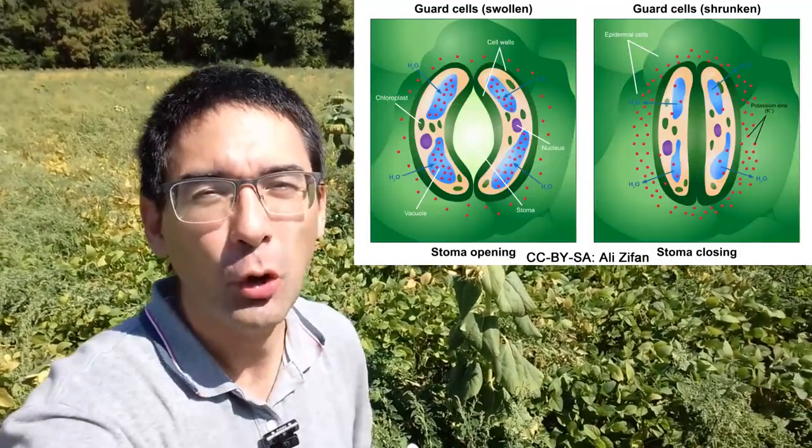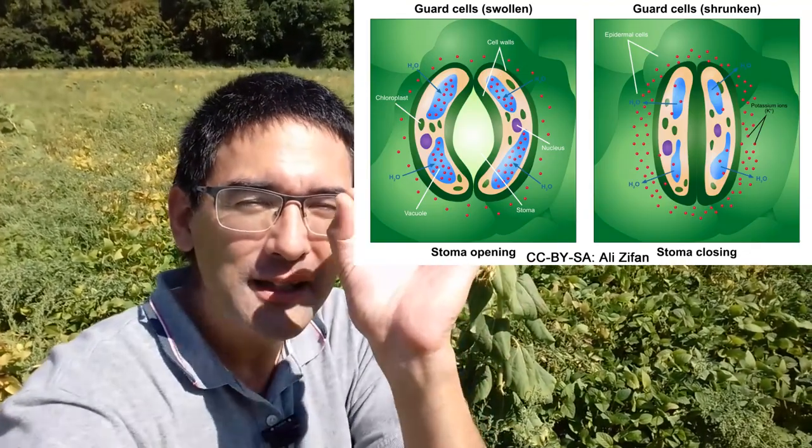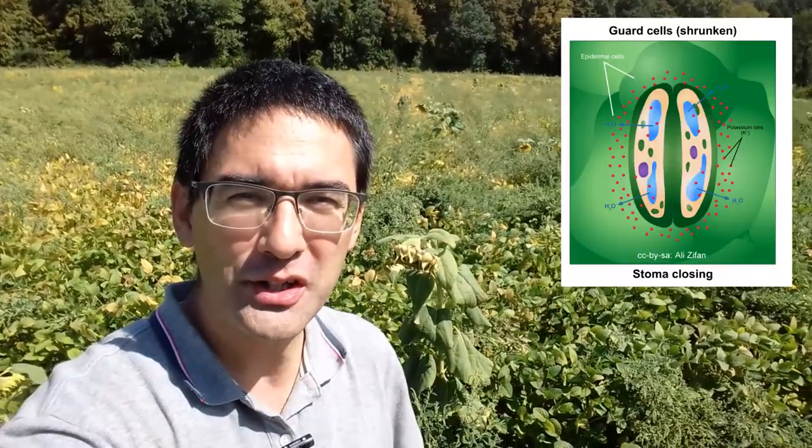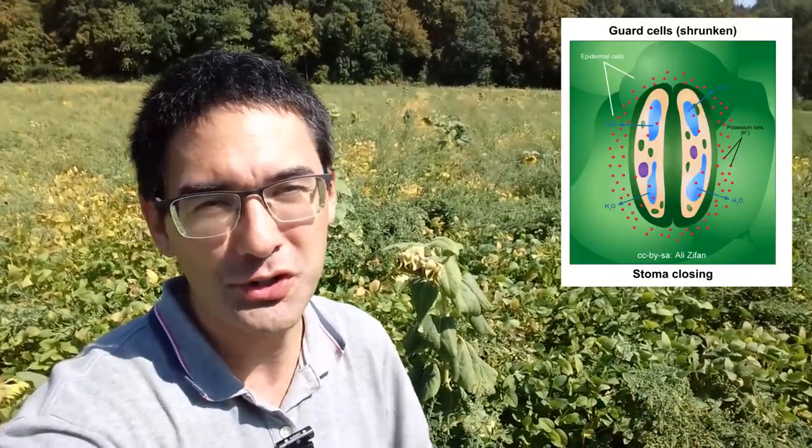Then I'm going to peel it off carefully when it's dry and put the glue under the microscope, because the glue now carries the shape of the surface of the leaf. By doing that, what I hope to see are the so-called stomata — these are openings in the bottom of the leaf which allow for gas exchange. During photosynthesis, during the day, these stomata are open and allow oxygen to diffuse out into the atmosphere, while carbon dioxide moves in because it's needed by the plant. During the night, the stomata close to prevent water loss.